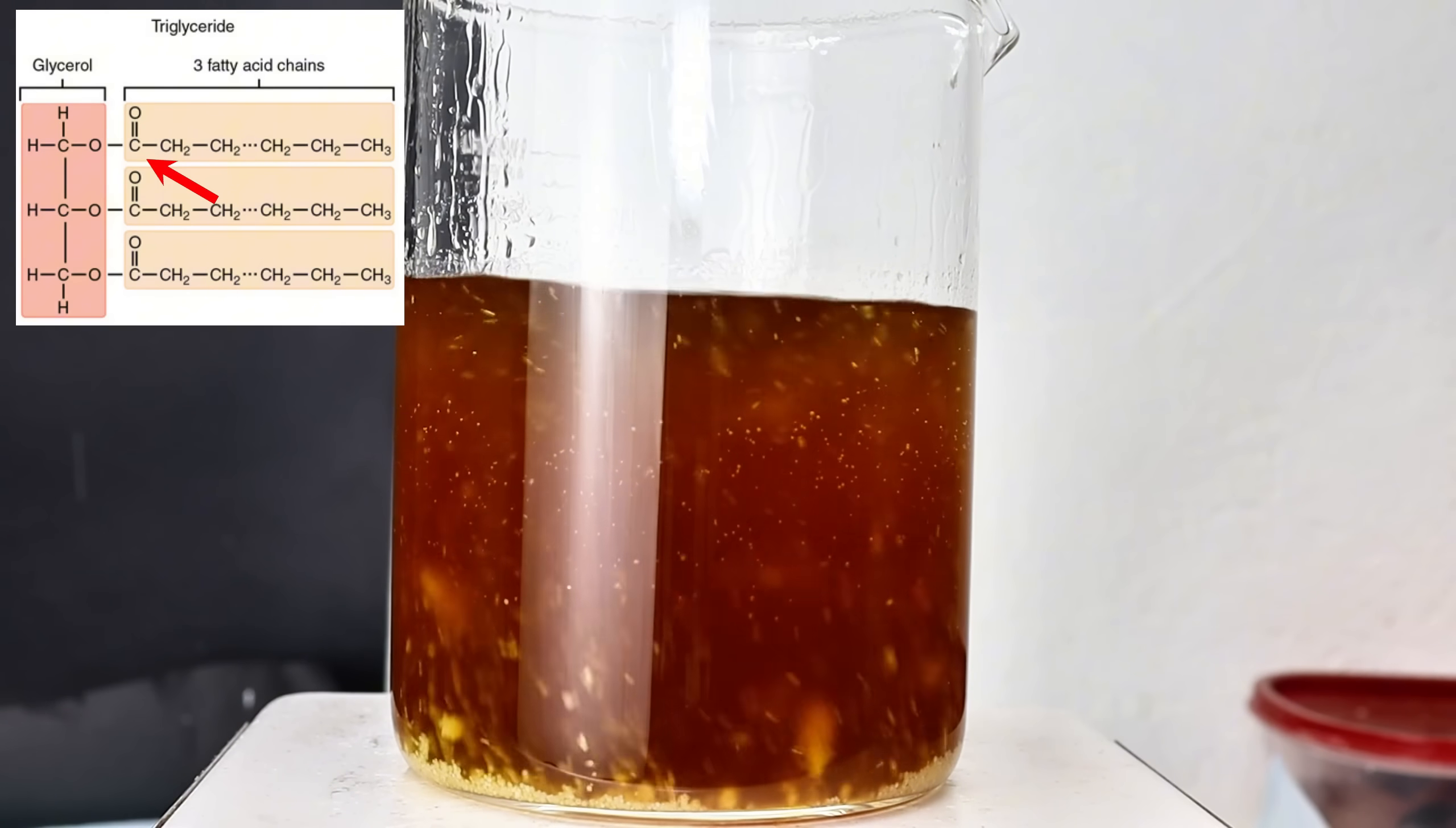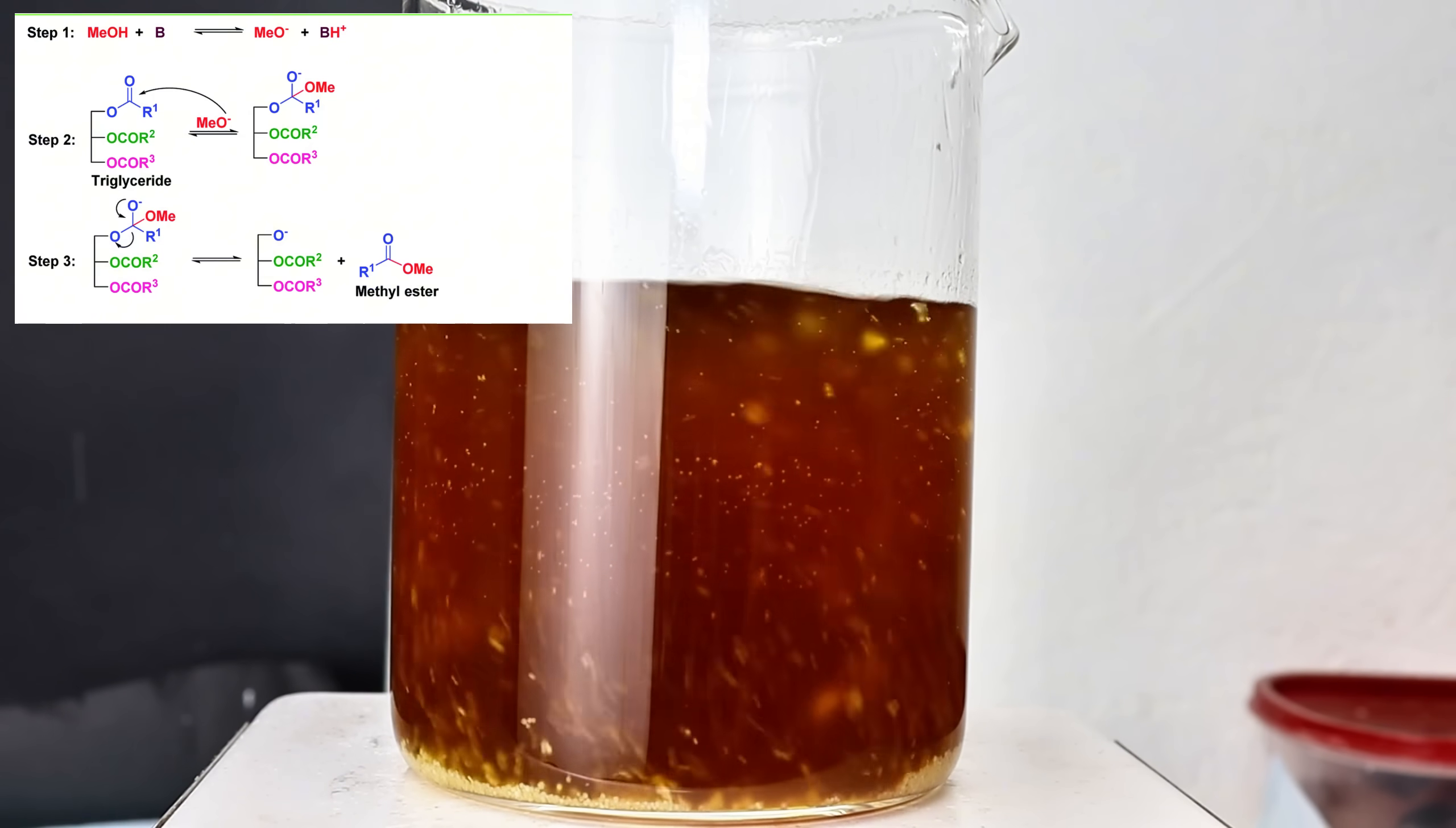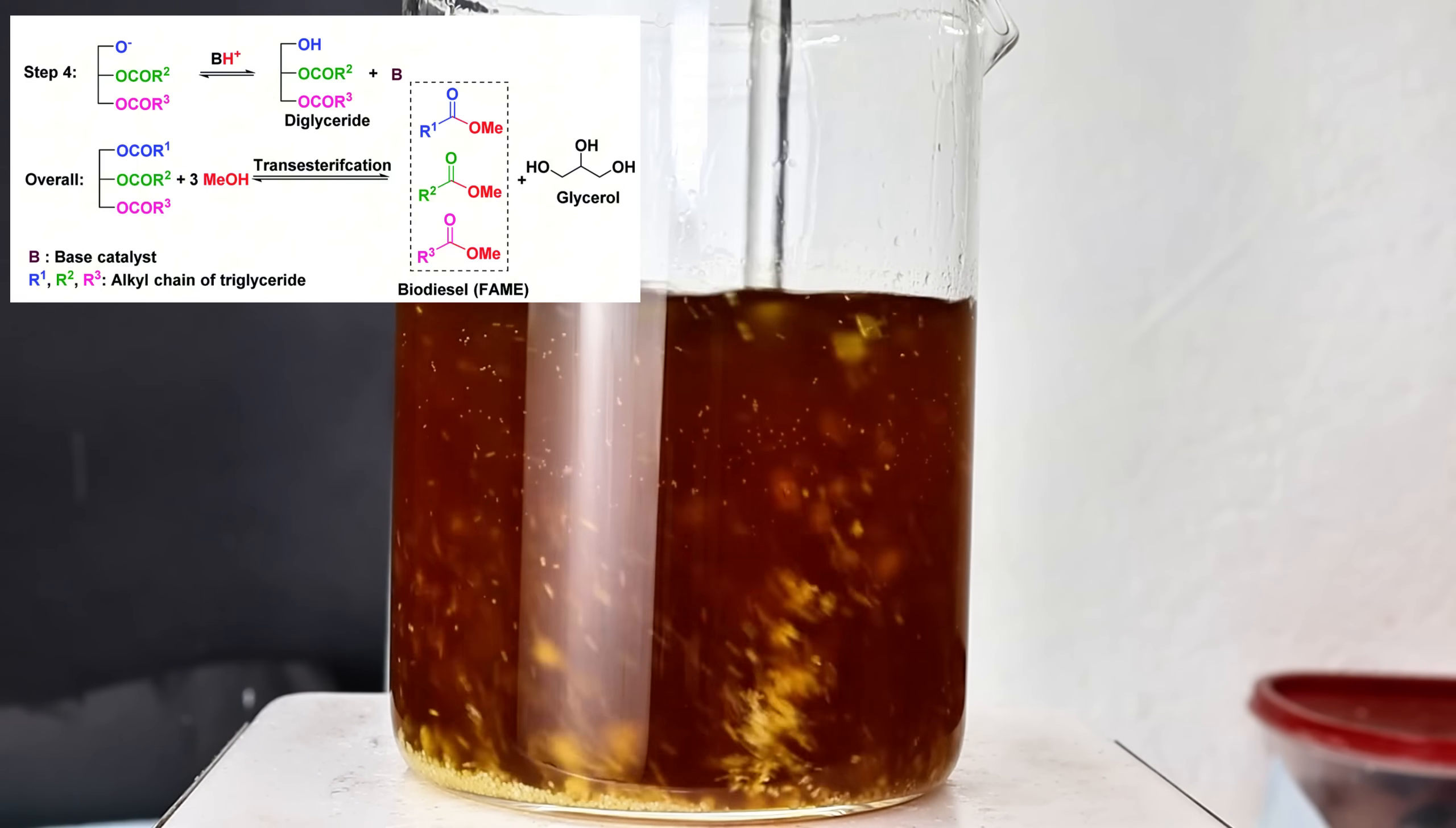This intermediate then rearranges and subsequently collapses, displacing a methyl ester of the first fatty acid. In the final step, the glycerol backbone is protonated by the water molecule produced during the formation of the sodium methoxide, and the process repeats.